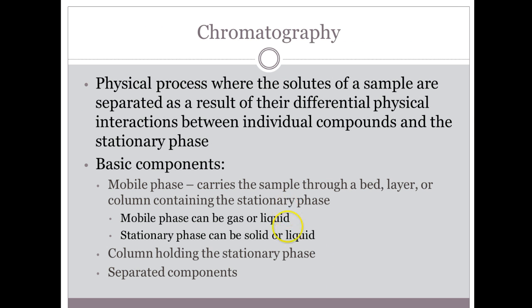The next one is chromatography. Kind of like electrophoresis, chromatography separates things based on their ability to travel through a mobile phase, compared to another component or a solution. They're going to travel together, and depending on how they interact, they're going to stop or keep going. So I'll show you a picture here in a second.